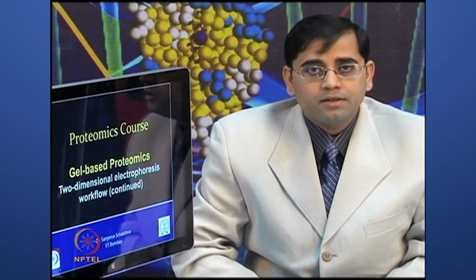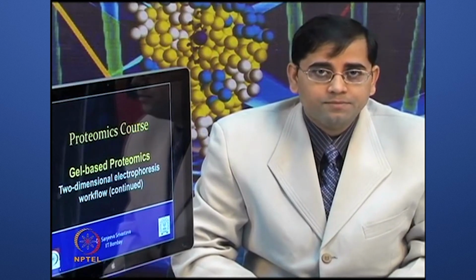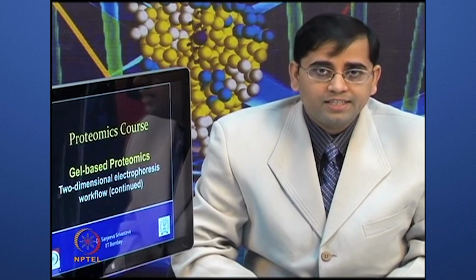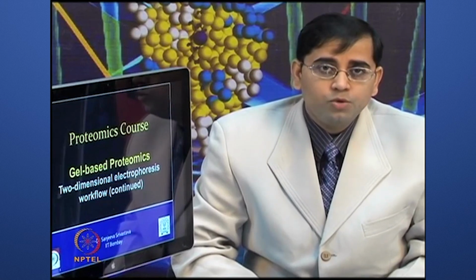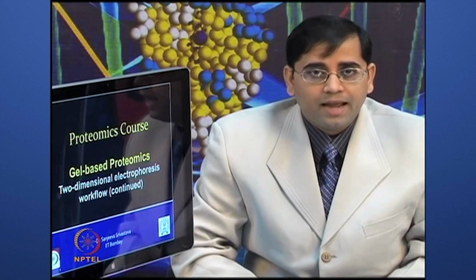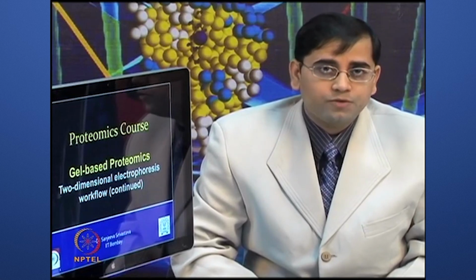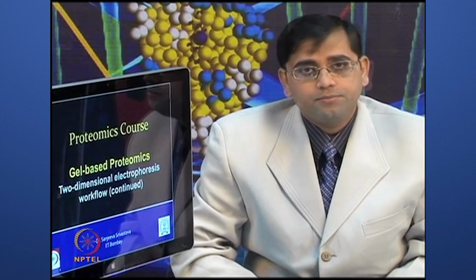As I mentioned, gel based proteomics includes various techniques such as SDS PAGE, blue native PAGE, two-dimensional electrophoresis, and advanced forms of electrophoresis such as difference in gel electrophoresis or DIGE.